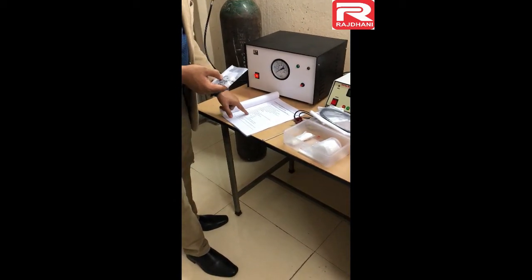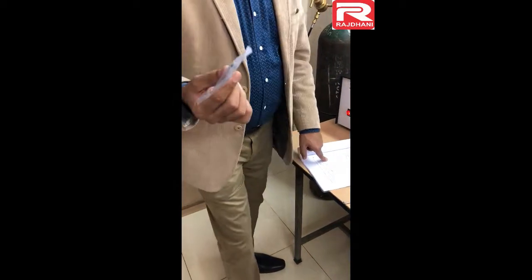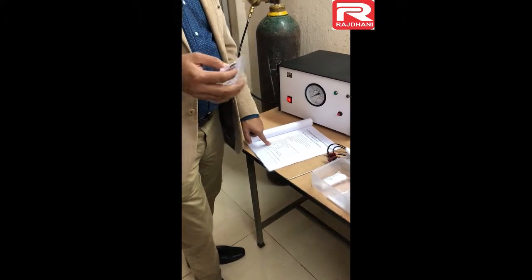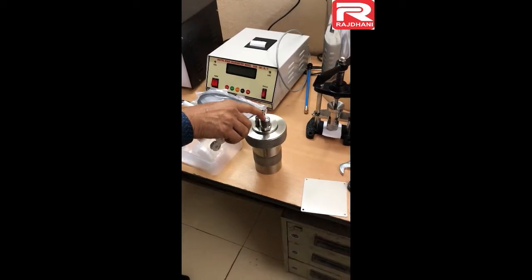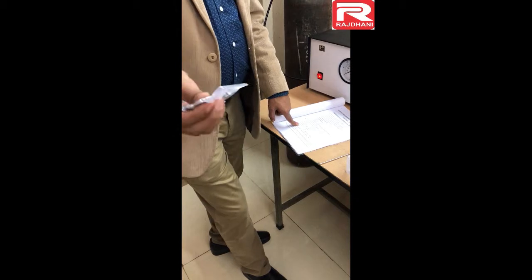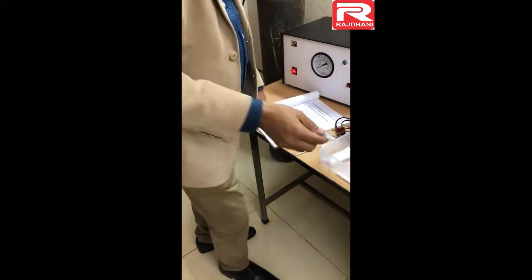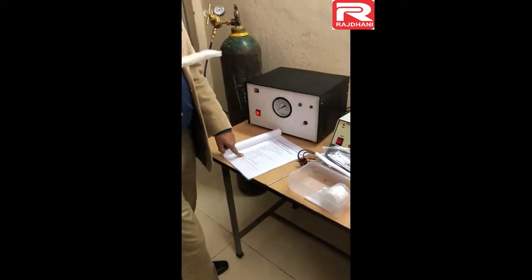Item number 19 is the ignition wire. One spool contains the ignition wire — this is a very thin wire which helps in igniting the sample. Then there are the Schrader valves: these are NRV (non-return valves), also called Schrader valves — Schrader is the name of the company. This is a heavy-duty valve used for this instrument, and 5 pieces are given as spares. The cotton reel helps in igniting the sample.